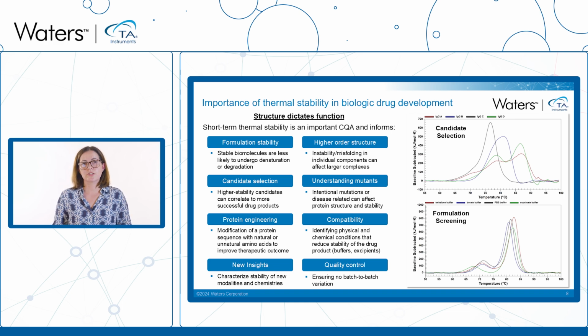Understanding the structure-function relationship of antibodies is fundamental for comprehending how functional variations arise, whether due to alterations in solution conditions or sequence modification. So by measuring the short-term stability under different conditions, one can have a better understanding of these drug products. So for example, we can look at formulation stability by screening for biomolecules more likely to undergo denaturation or degradation.